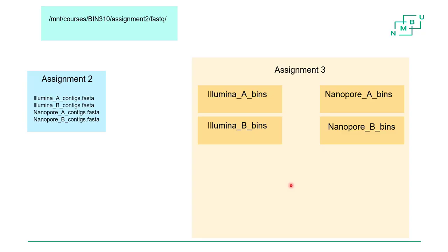It's important that we always do it like this when we have contigs from different samples. We should treat them separately for some time, especially this coverage information, right? It's very important that you take the A sample reads and map against the A sample contigs and not against the B sample contigs, for instance, because these contigs are made from a different sample.